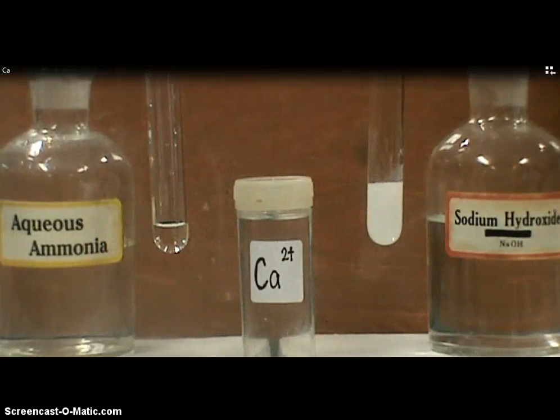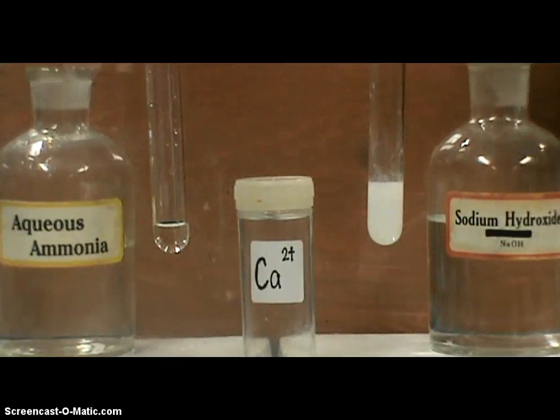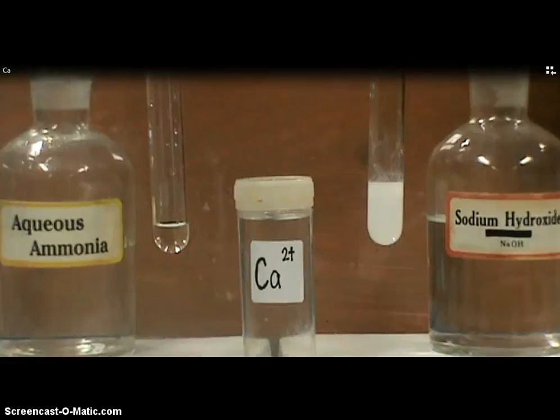Upon addition of excess aqueous sodium hydroxide, the white precipitate remains insoluble. Since there is no precipitate formed when a few drops of aqueous ammonia is added, there is no need for us to conduct the further test using an excess of aqueous ammonia.